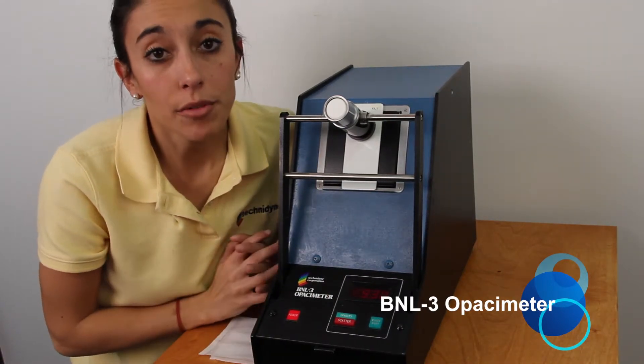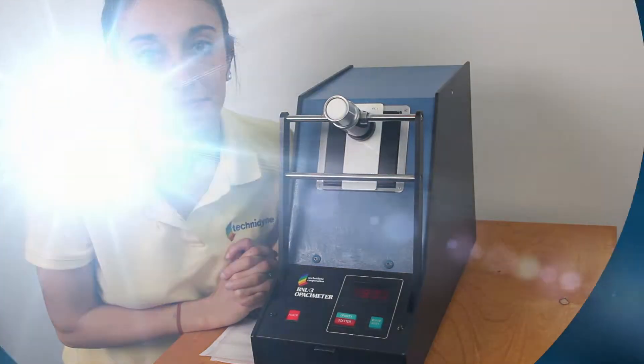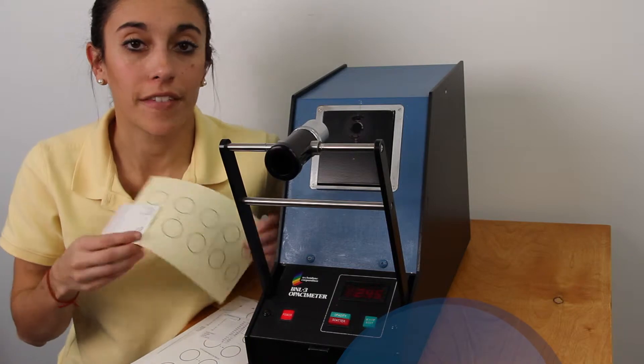If it's not within range, you can refer to your operator's manual for instructions on adjusting the white body to bring the data in. Now that we've finished our primary calibration, our last step is just to verify calibration using our paper verification standards.